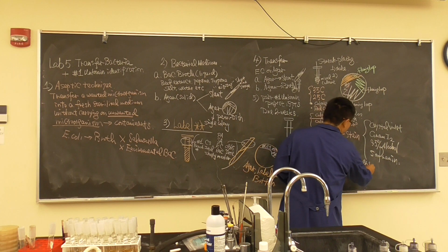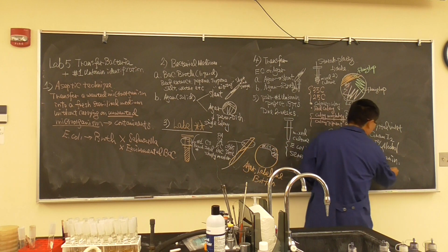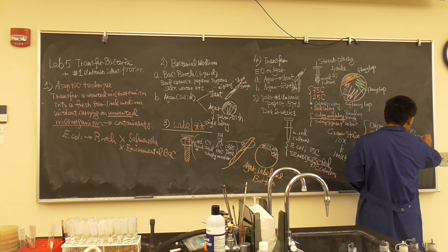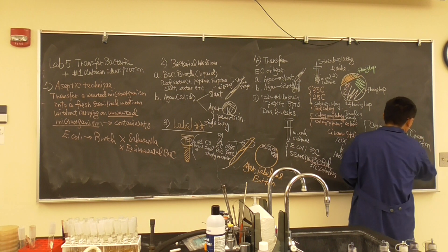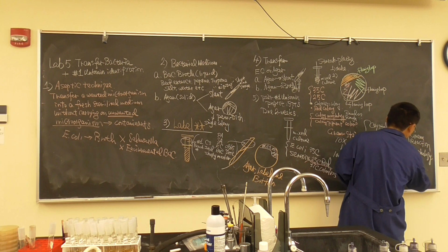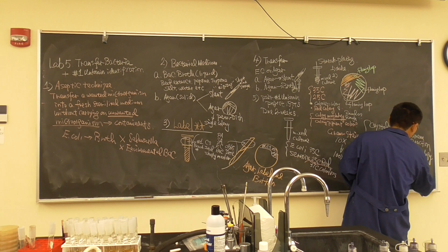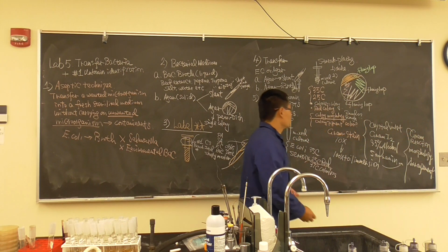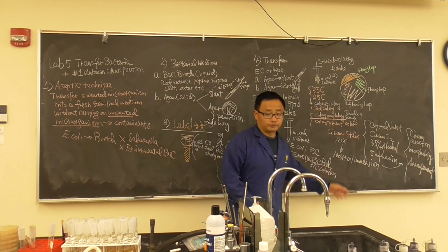You need to record the 3 pieces of information for me, which I'm going to write here: gram reaction, morphology, and arrangement. And that will be the report for you.